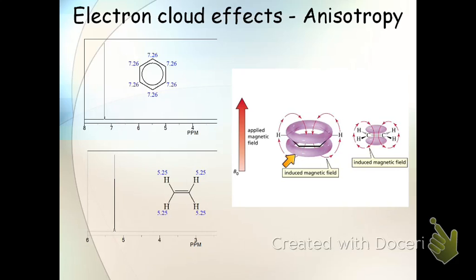This magnetic field line is going around in a circle like this because it has to be closed, and it comes back through the center, and it loops around like this. Okay. Now, if the magnetic field being induced down the center of the structure is, let's say, a 6 parts per million offset, just arbitrarily, that means on the center, the magnetic field is weaker, but on the outside, the magnetic field is stronger.